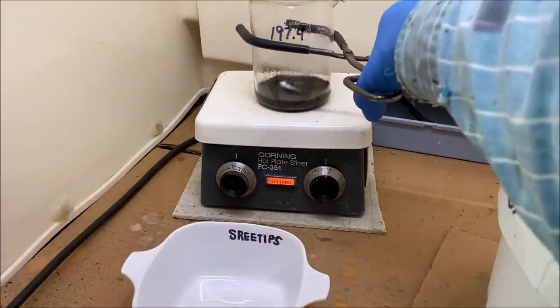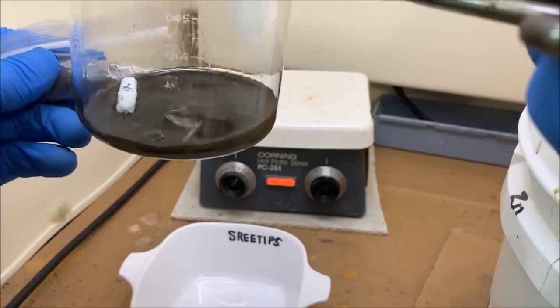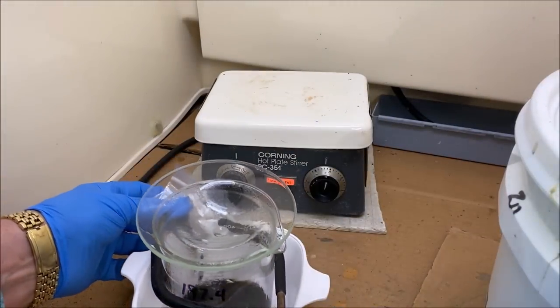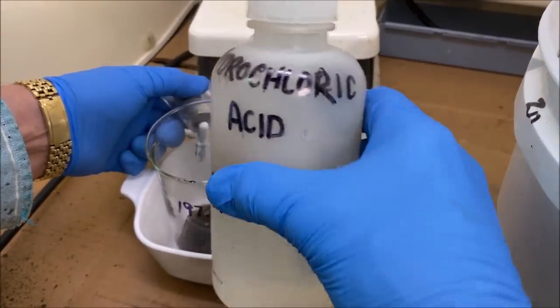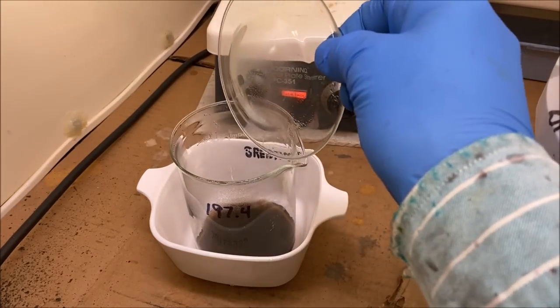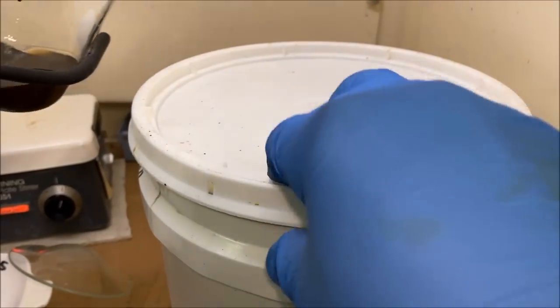This has been boiling now for about 15 minutes, low heat, and you can see the platinum metal down there on the bottom. Get that stir bar out of here. Come on now, work with me. Looks like we put a little bit of something in solution. See the color? What we'll do is pour this off now into the stock pot.